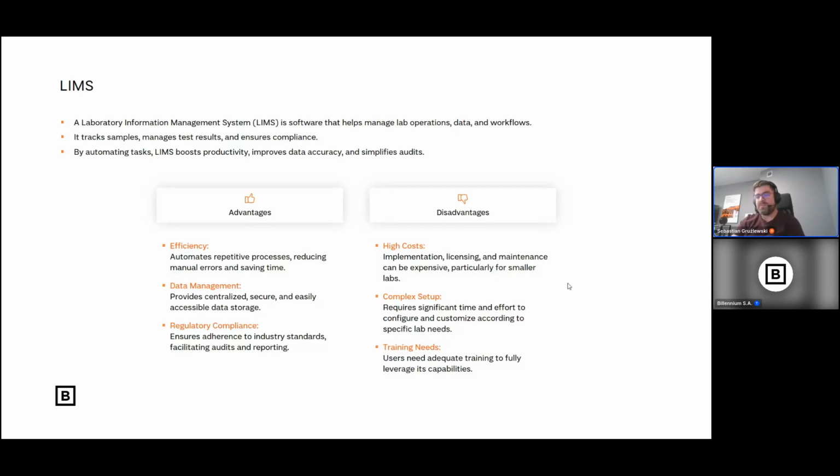It's often used to interface to other systems, basically to retrieve information about sample details, limits, and it may also be used to round results based on the specification of a given analysis.